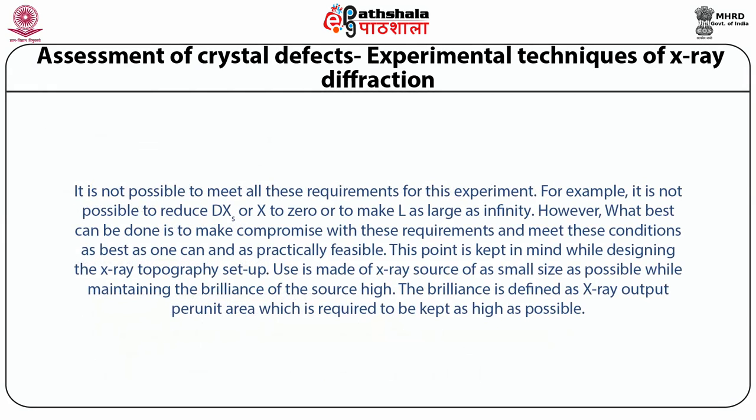It is not possible to meet all these requirements for this experiment. For example, it is not possible to reduce delta XS or x to zero, or to make capital L as large as infinity.